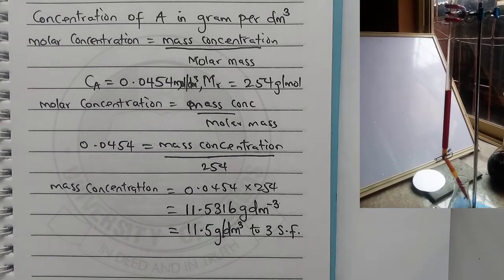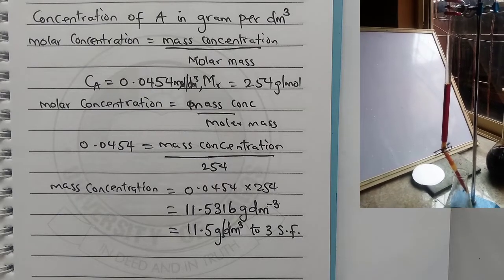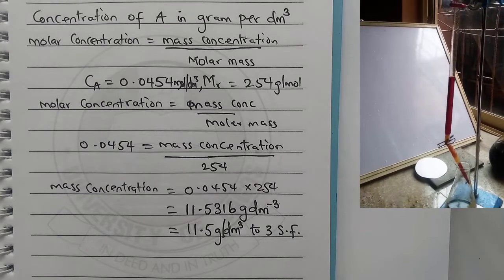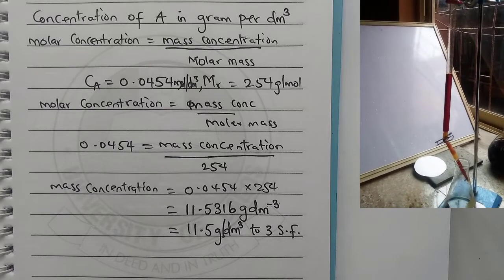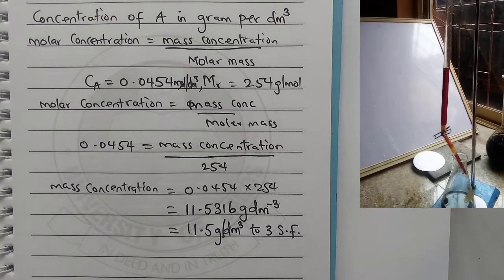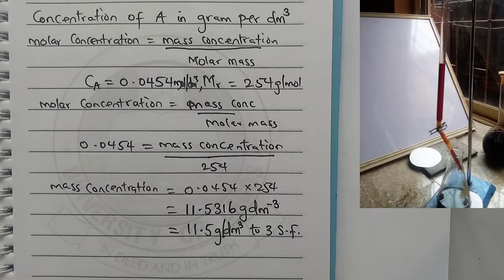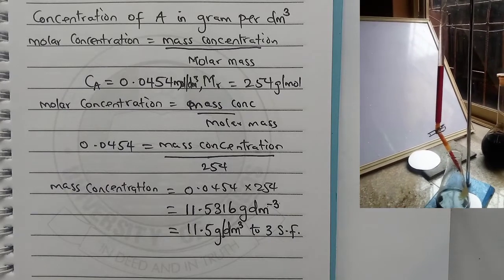In the previous work we did in 2019, it was actually solution A that was solution B. Our solution A currently is the solution B of 2019. It was a little easier for teachers to do away with, but this time around it starts to be shaky work. Therefore, if you look at this value 11.5 gram, we are going to use it.